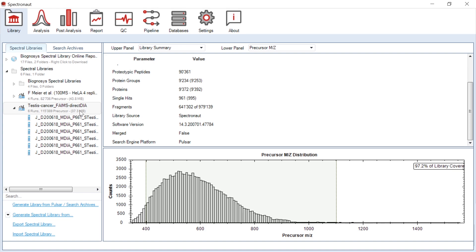In FAIMS, ion mobility is used as an ion filter before their separation in the M over Z dimension. You can regulate FAIMS filters by applying chosen compensation voltage, CV, either single CV value for the whole acquisition or multi-CV values changing sequentially through the whole acquisition time.